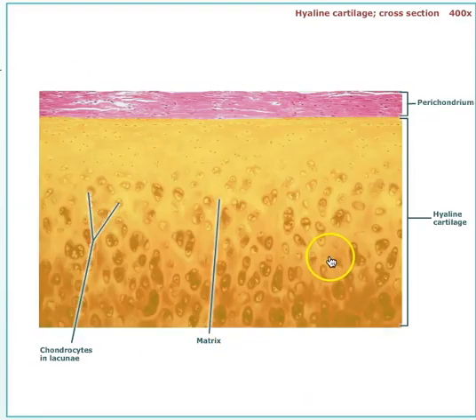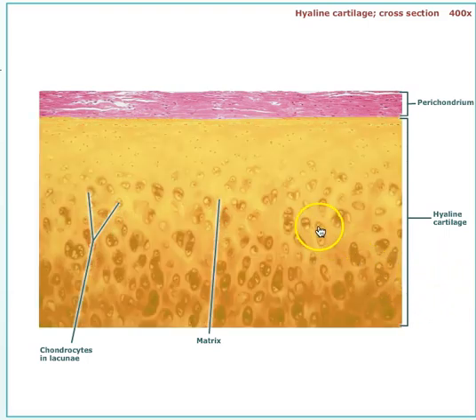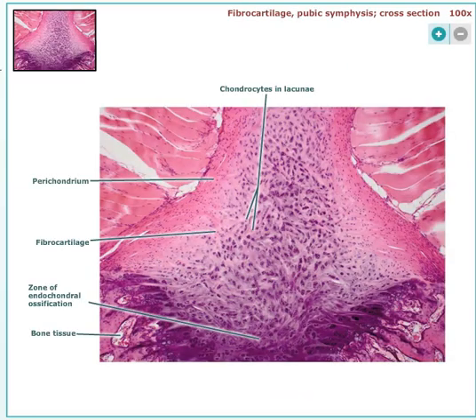There's more hyaline cartilage. Here, this is at 400 times magnification. But yeah, this is that telltale sign of the chondrocyte floating in the lacuna, and then the lacuna floating in the matrix. More of hyaline cartilage, more of the hyaline.